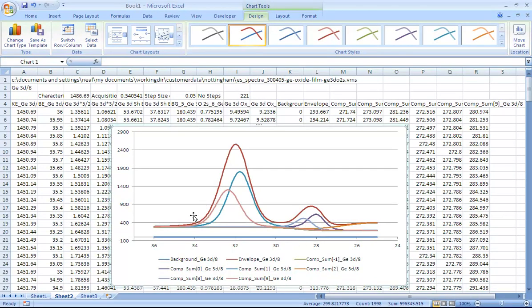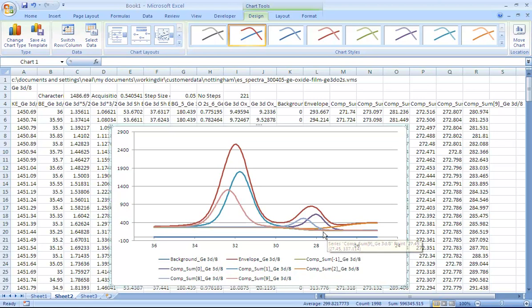...we now see that the component peaks that are meant to be bell-shaped and photo emission signal are now sat on top of the background signal that is a consequence of inelastic scattering.